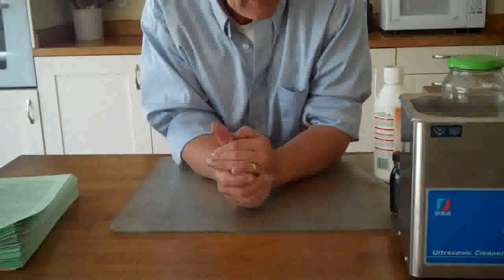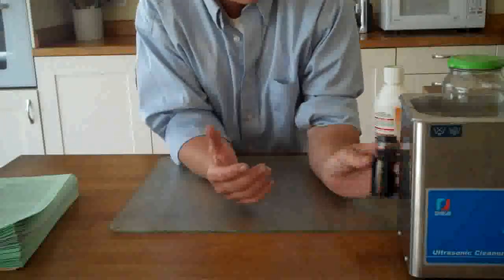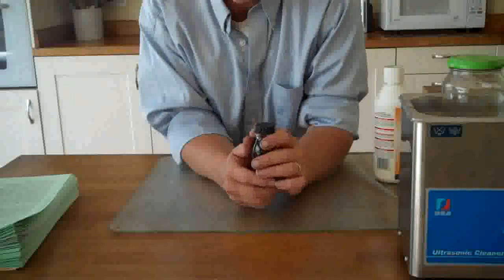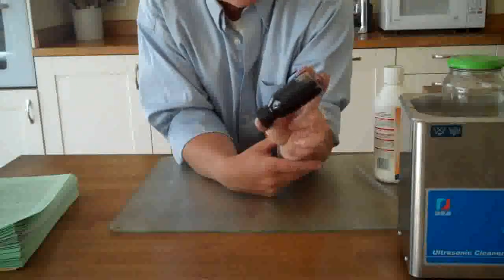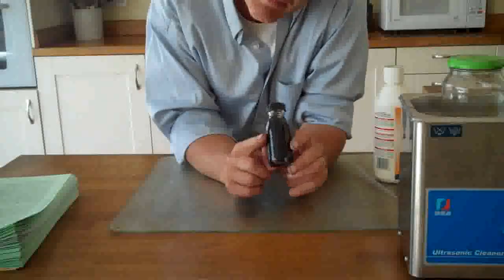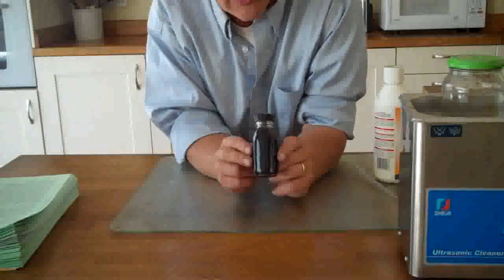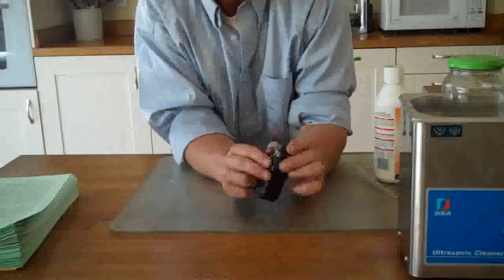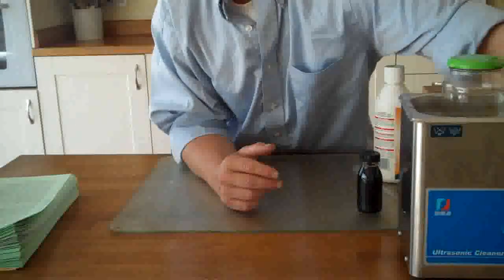Sure enough it will bubble away and go black. About 20 to 30 minutes in, it'll go black and it forms this really nice dark black solution — this is graphene, graphene in water, and that's what we're going to need for our later experiments. So mix up those 3 things, pop it in your sonicator, turn it on, and wait for an hour.